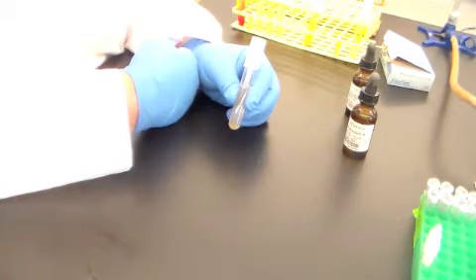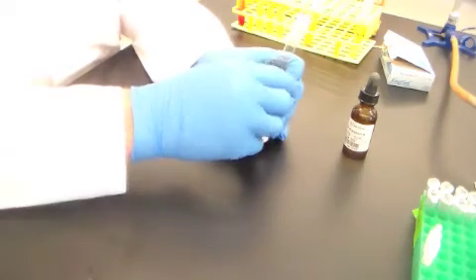But it's not done there. When nitrate is utilized in its entirety, Paracoccus denitrificans can then reduce nitrite to nitric oxide, and then reduce nitric oxide to something like nitrous oxide, and even to atmospheric dinitrogen. So there are other reduction processes that can occur in bacteria, and you could get a false negative. So that's what I'm hoping is going to occur with the soil bacteria.